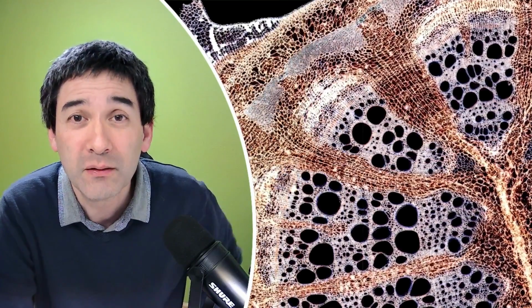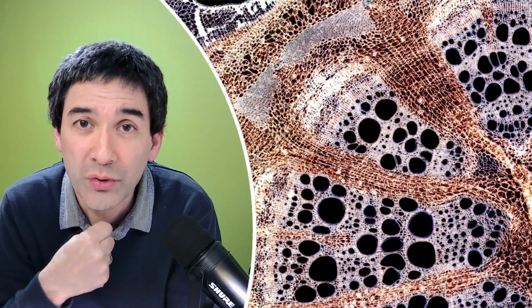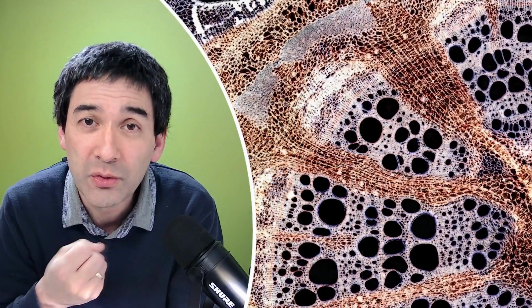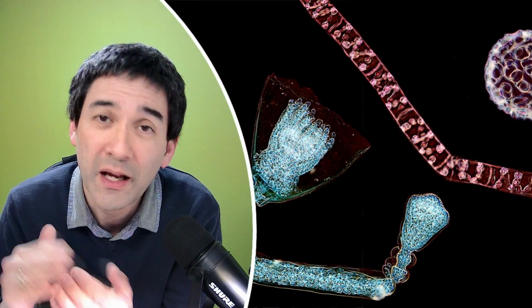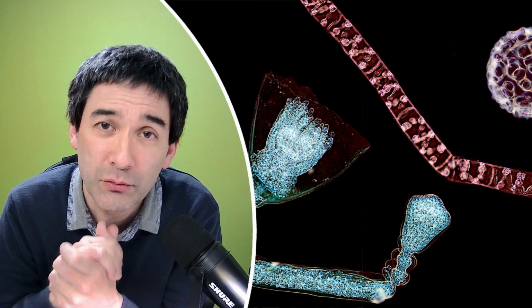So what I've been trying to do and experimenting around with is, maybe when you wash them, you don't rub them between your fingers to remove the dirt, but you simply allow a detergent to do its activity. So what I do is I take the slides with the cover glasses. In most cases they're dry and the cover glass sticks to the microscope slide.